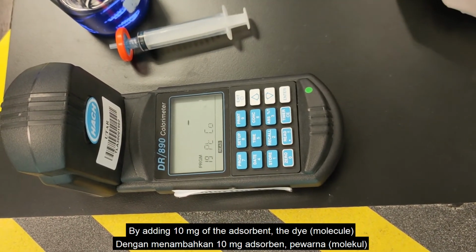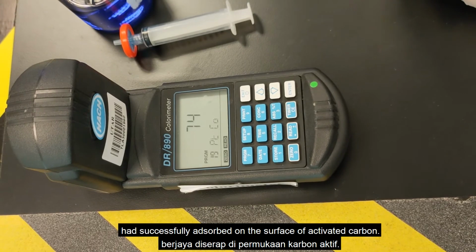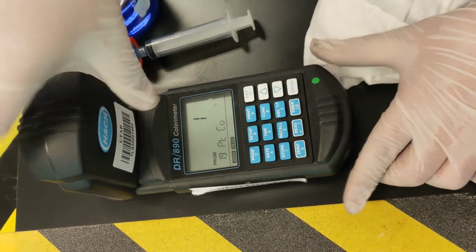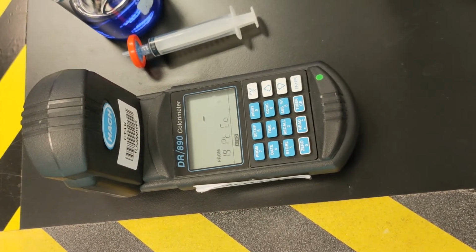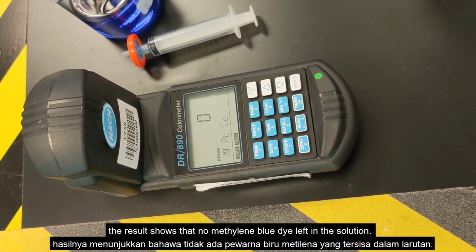By adding 10 mg of the adsorbent, the dye was successfully adsorbed on the surface of the activated carbon. For the 150 mg of the adsorbent, the results show that no methylene blue dye is left in the solution.